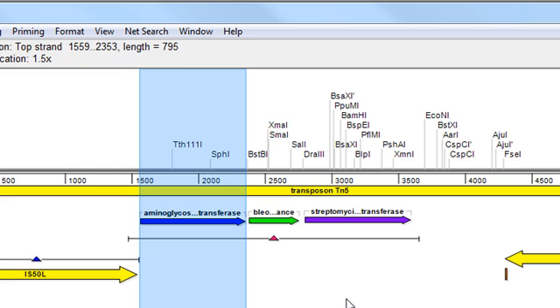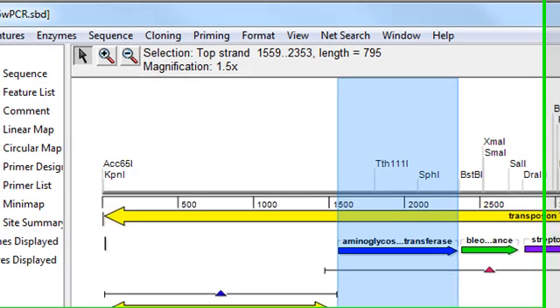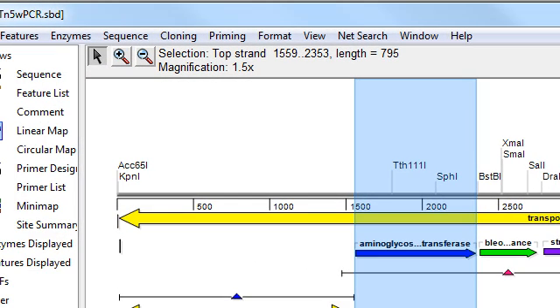The second step is to create a directional TOPO insert from the selected sequence so that it's ready to take part in a TOPO cloning reaction.